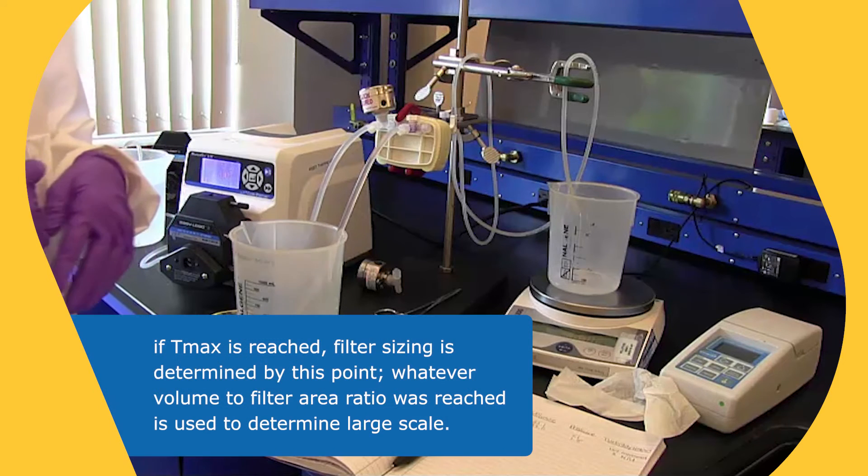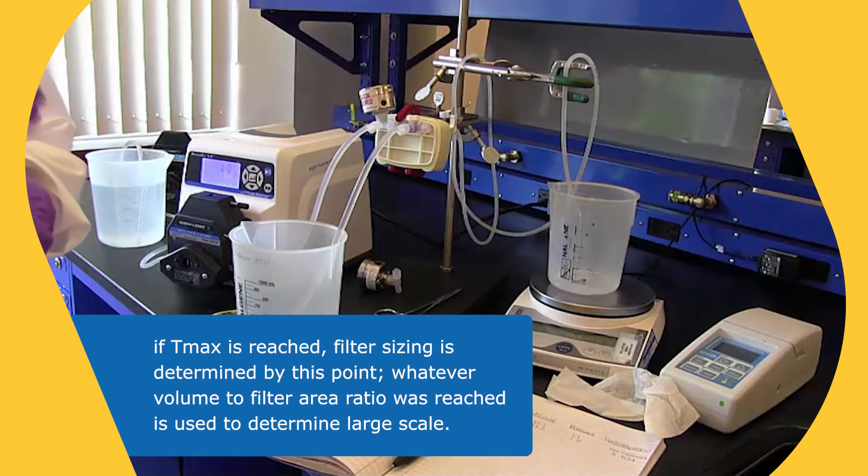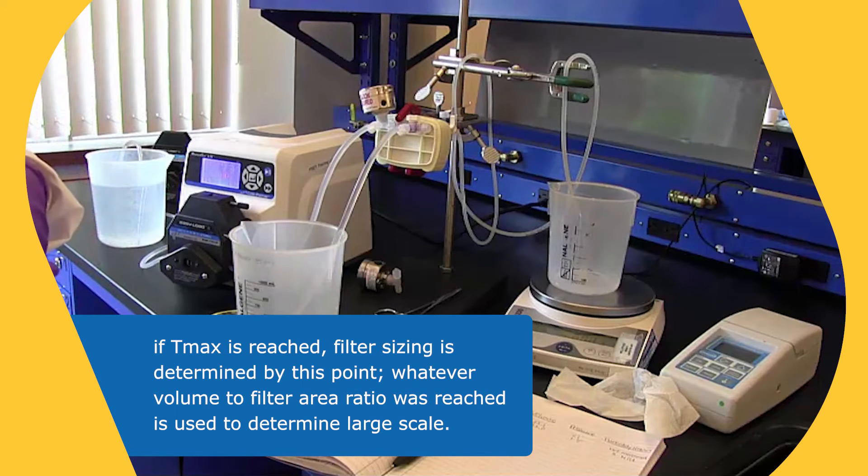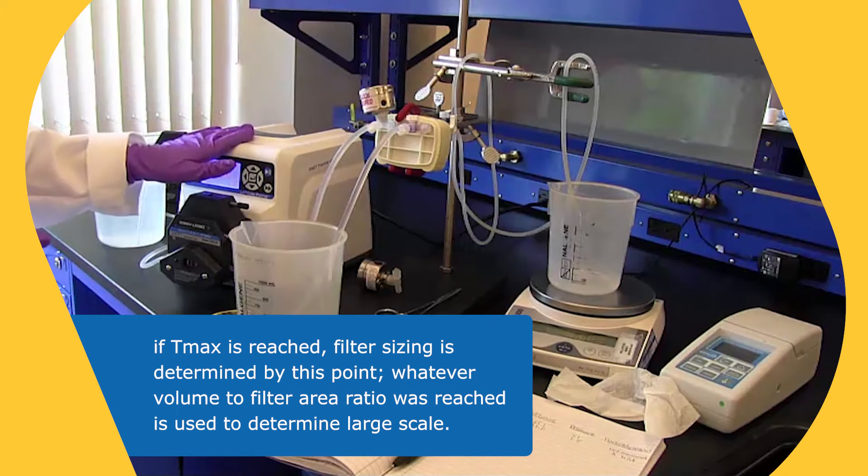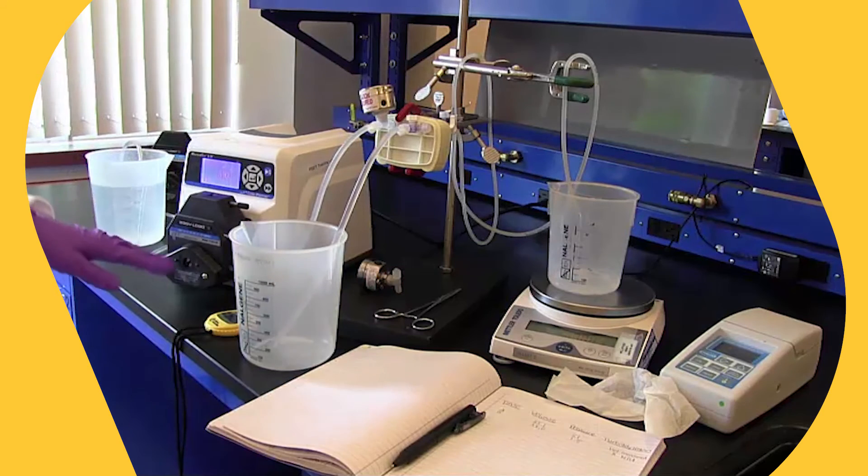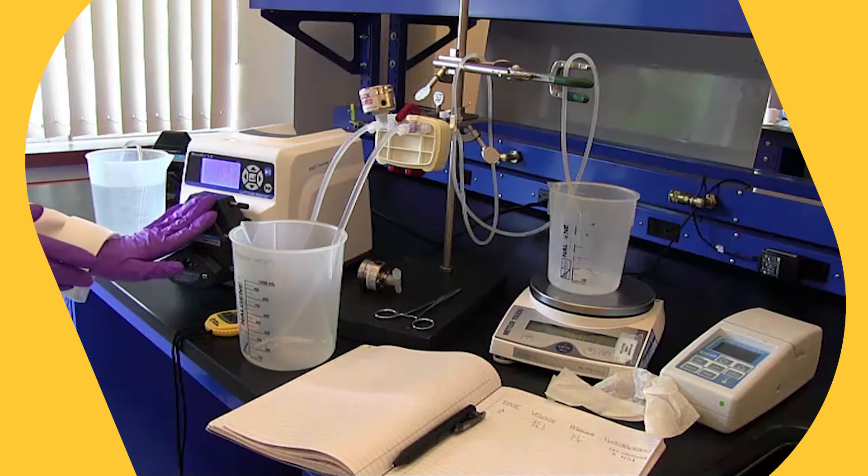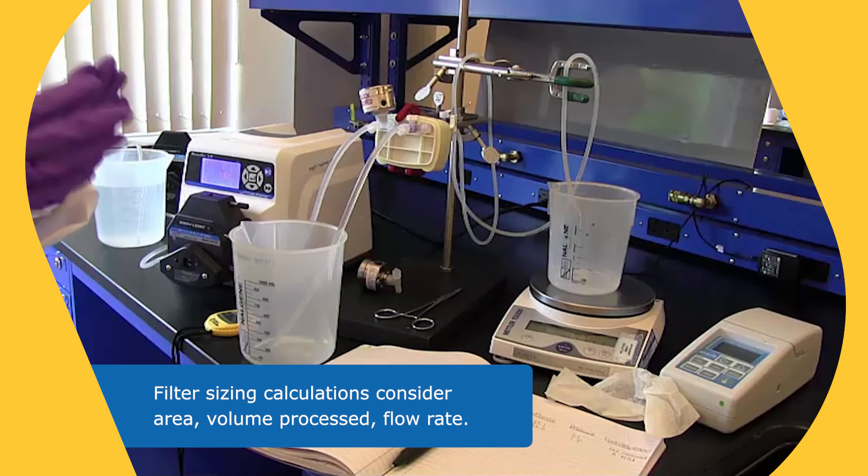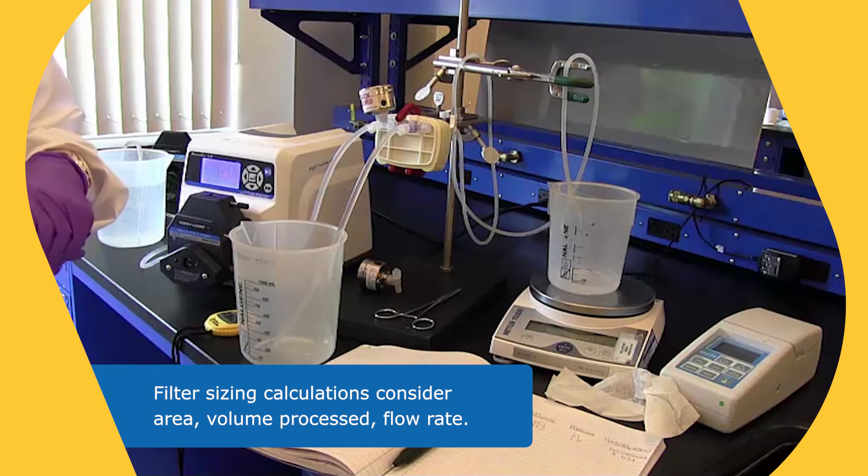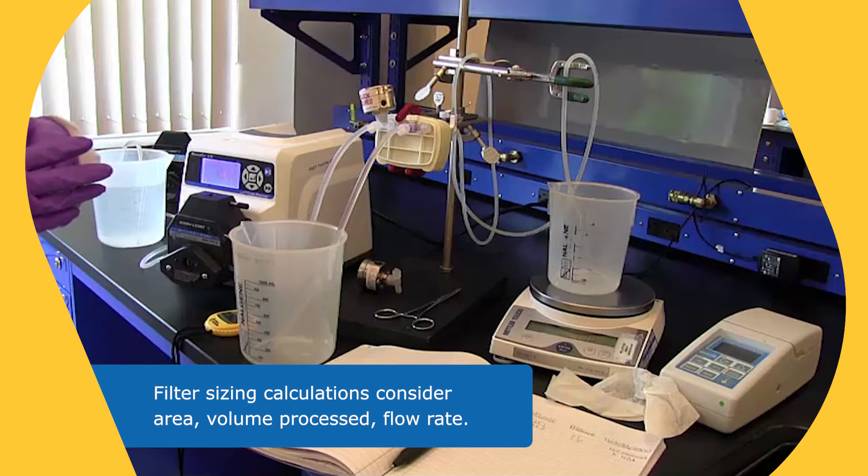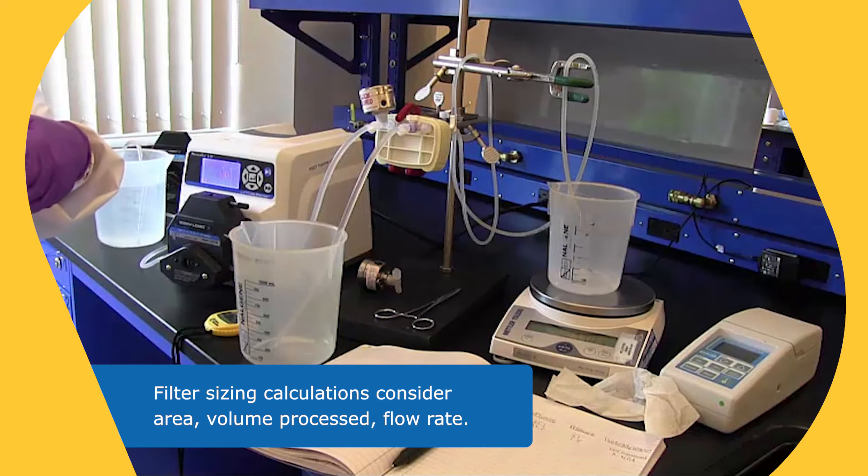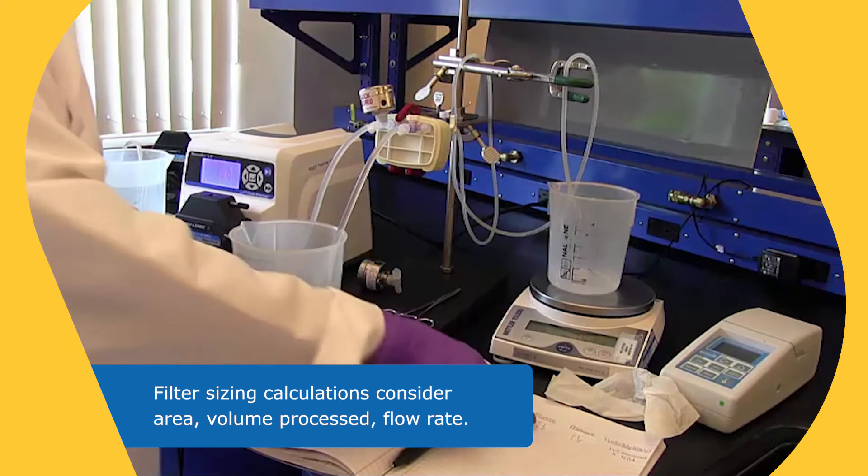Another thing you might see is that the pressure may go all the way up to 20, and then you see it back off to like 18 or 17, and that's a little bit confusing. What sometimes happens, depending on the condition of your pump or how many times you've used the tubing, you may be seeing pump slippage, where it's just kind of skipping. And there's this pressure buildup, but then as there's a release of pressure between the rollers of the pump heads, the fluid just shifts back a little bit. And so it basically reduces the pressure when it does that. When we do the calculations for sizing, we normalize for all of these changes. So we normalize for area, in case you were using a filter with different area, and we normalize the volume for flow rate as well. So we can calculate the flow rate from the volume and time data that you're collecting.